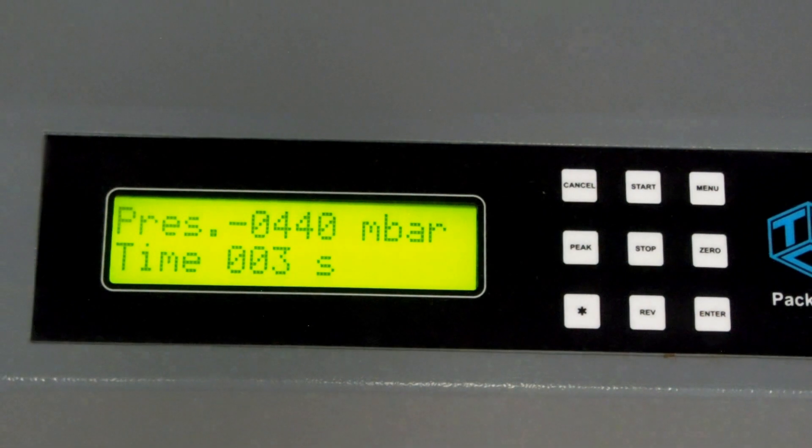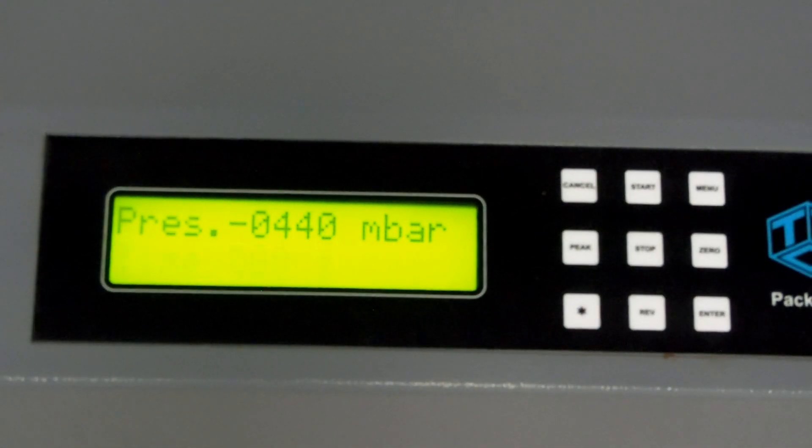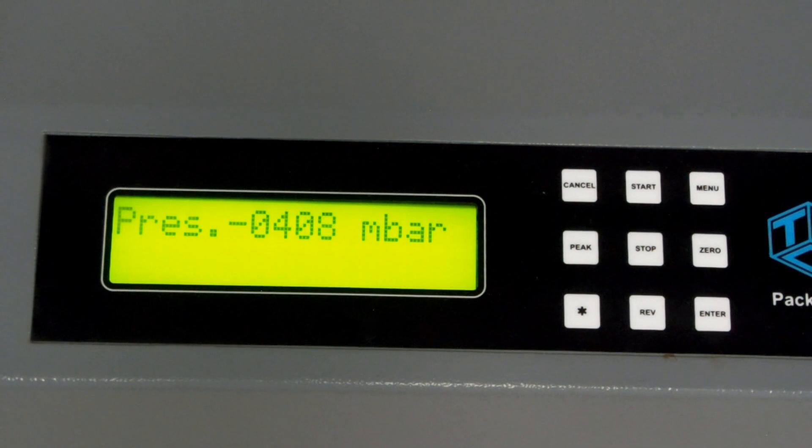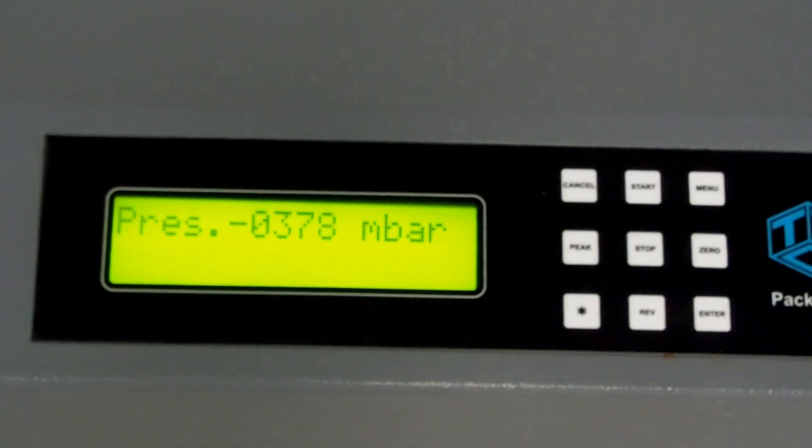As soon as the desired time setpoint is achieved, the system will discharge the vacuum in the tank and bring it to atmospheric pressure.